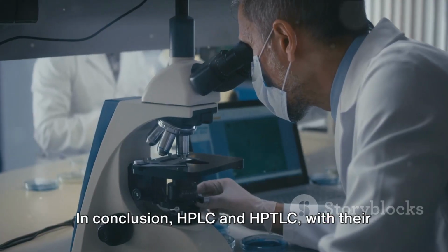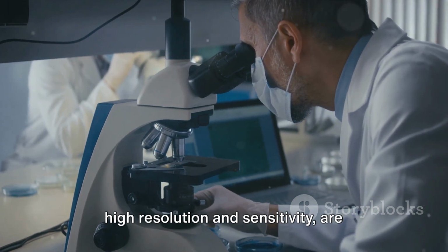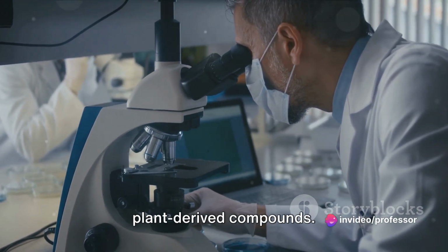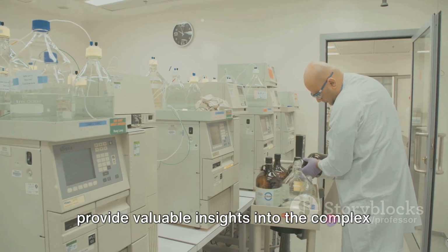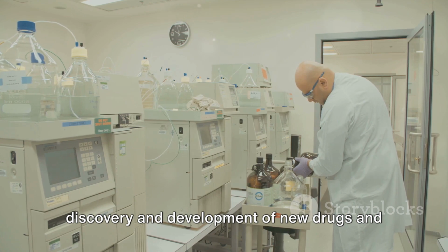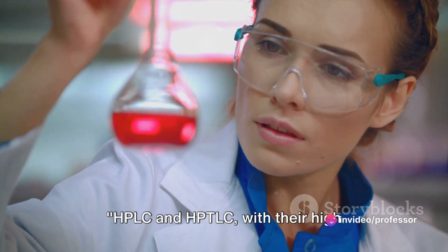In conclusion, HPLC and HPTLC, with their high resolution and sensitivity, are indispensable in the modern analysis of plant-derived compounds. These advanced chromatographic techniques provide valuable insights into the complex world of plant chemistry, aiding in the discovery and development of new drugs and therapies from nature's medicine cabinet.